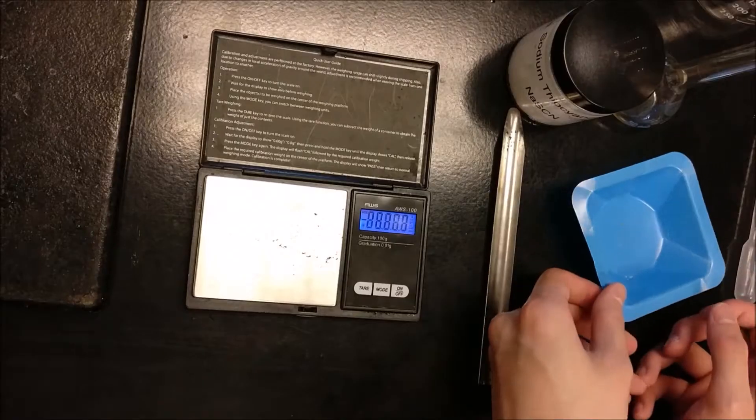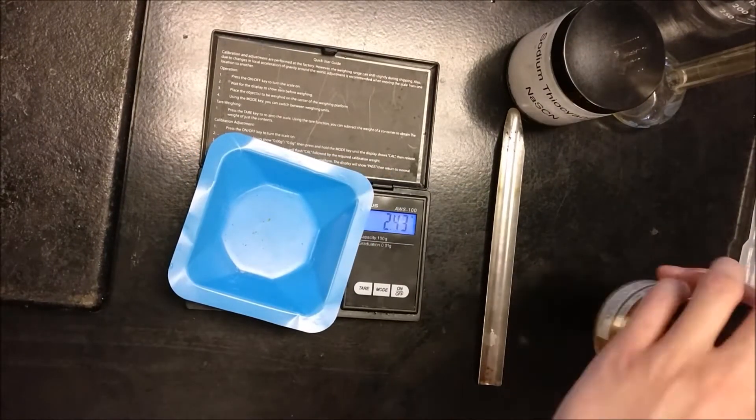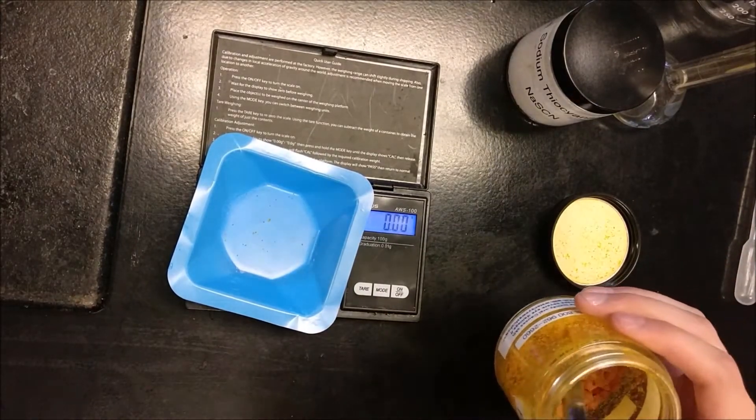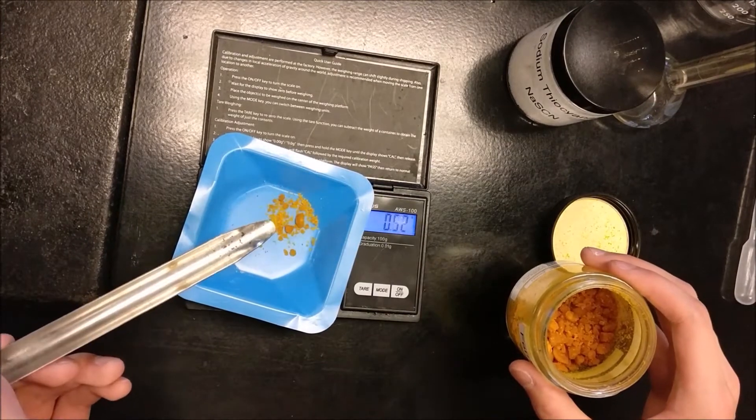First, zero off the weight boat. Then measure approximately 0.5 grams of iron-3-chloride hexahydrate and record the weight you measure out.